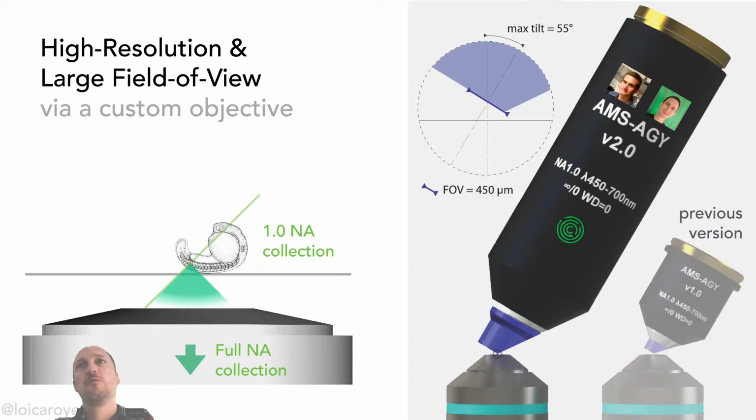If you want to track cells over space and time and their divisions in very tight regions of the zebrafish embryo, which is something we're interested in, you need as much resolution as you can to get crisp images and also very good Z resolution. So overall, NA is always important. It was always difficult to push beyond 0.8 NA in light microscopy, at least for embryo scale imaging.